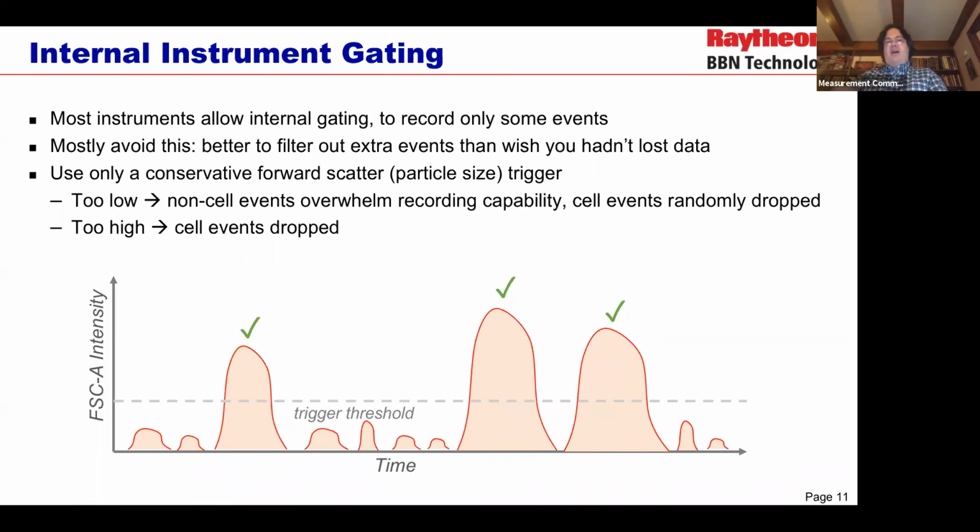I see a couple Q&As. Question about, can a pulse be compared or set to a certain frequency? So this is a different type of pulse than that, where we're talking about just a signal that goes up and down as something goes through a laser. So it's not really a frequency here, it's just a single blob.